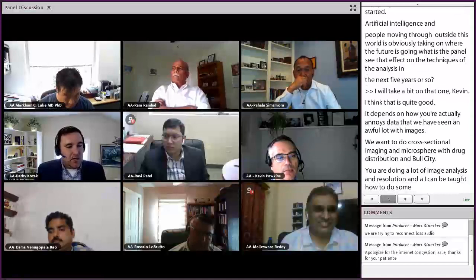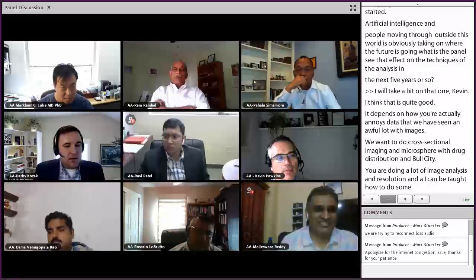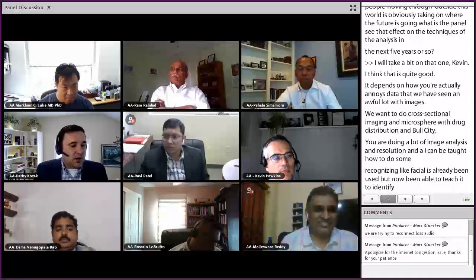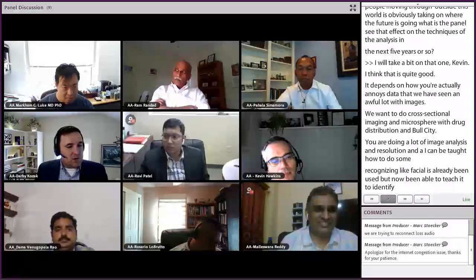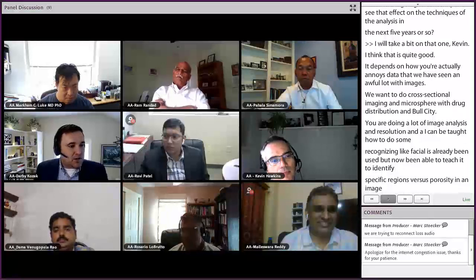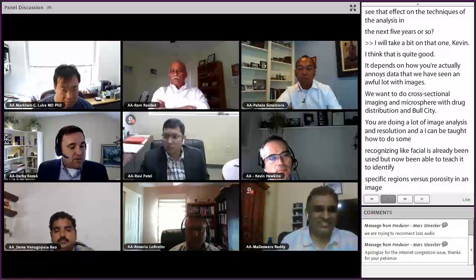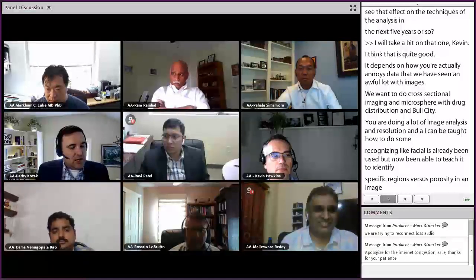So now you're going to be able to do image comparisons on a much larger level, which would have been prohibitive in the past. One thing with microscopy and other images has always been that the ways in which we can compare have been very rudimentary. Computers made the next shift, so we can do particle size characterization just on an outline. Now I think it's going to go to the next level, and we're going to be able to feed in lots and lots of images to get a lot more information.